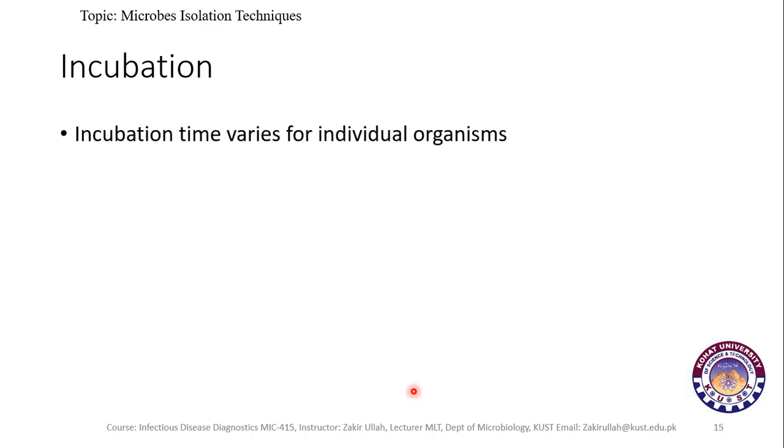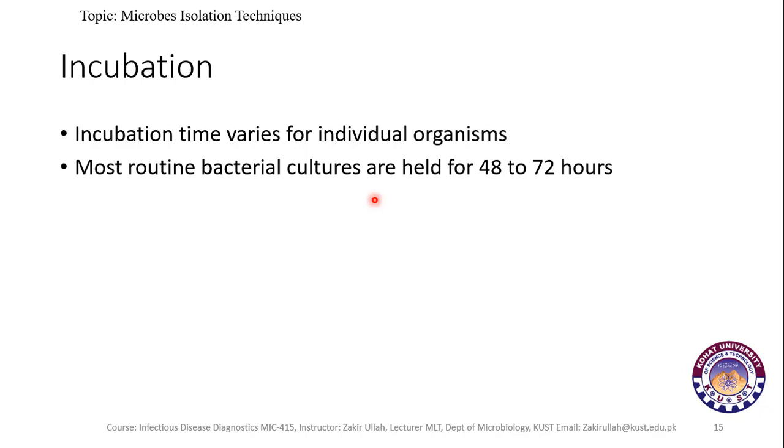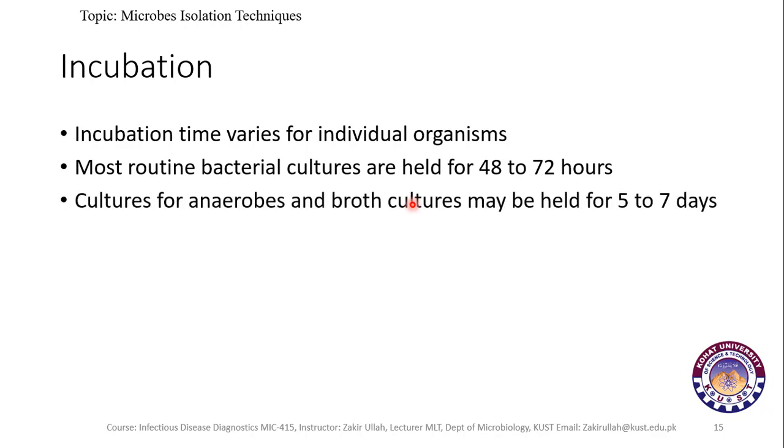The incubation time varies for every individual organism. For most cultures, they are incubated overnight or 48 to 72 hours, and the cultures for anaerobes and broth cultures are held for 5 to 7 days.